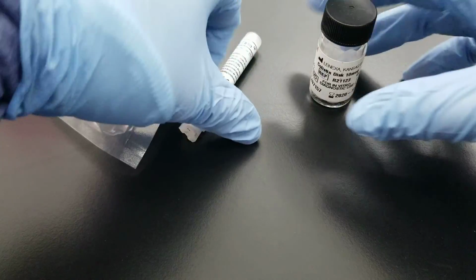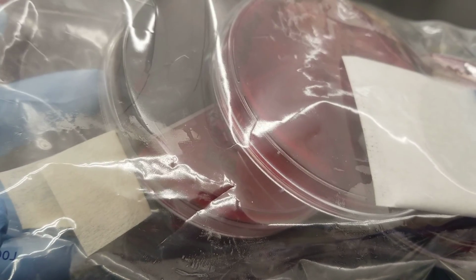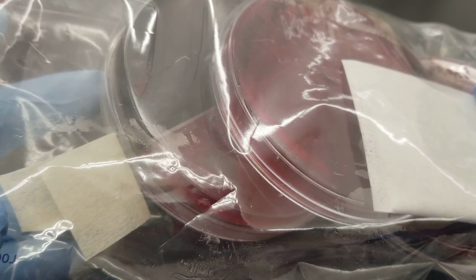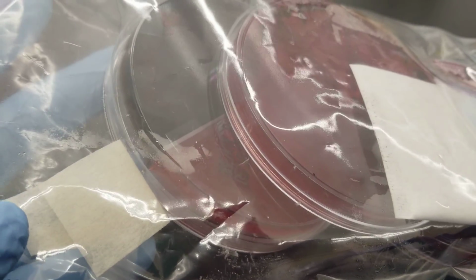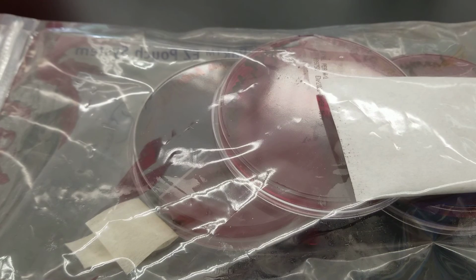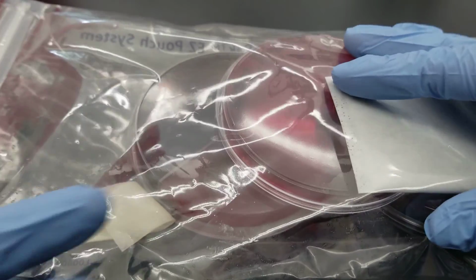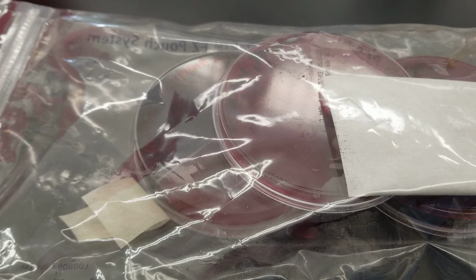So the primary setup for this patient specimen ended up having growth on just the anaerobic setup, and you can see the blackening of that, sorry, not the Brucella blood agar plate, the BBE, the Bacteroides bile esculin agar.